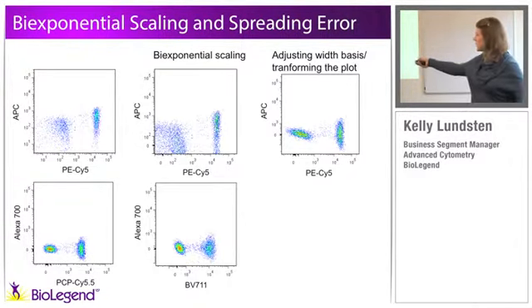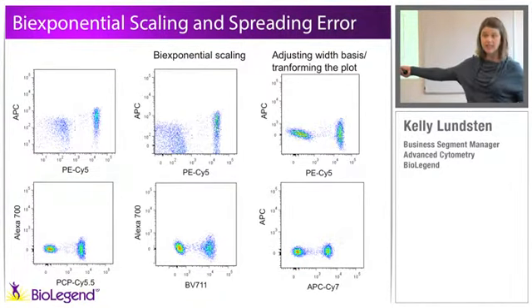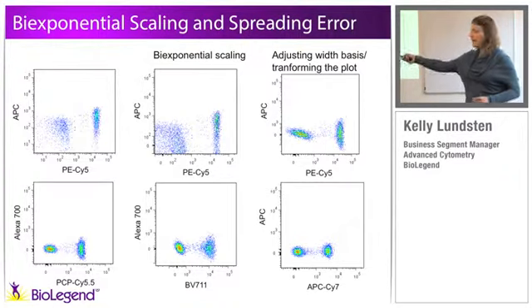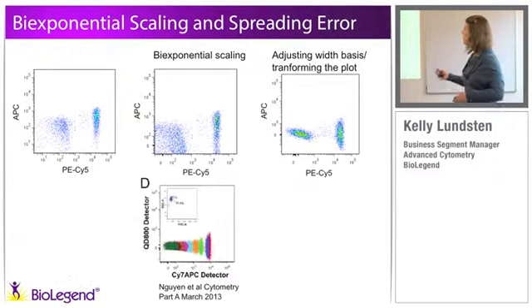So in this instance, that spreading error, again, is not necessarily created by the spillover. And then we have molecules like APC-Cy7 spilling back into APC because the tandem is incomplete. So again, PerCP-Cy5.5 does spill directly into Alexa 700, cross-beam significantly. You can create spreading error by unbalanced voltages or from incomplete tandems or as the tandems start to break down.